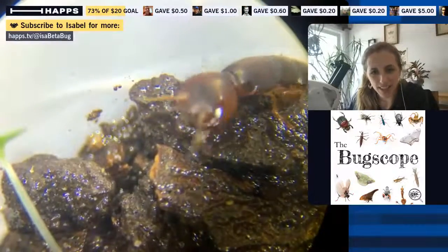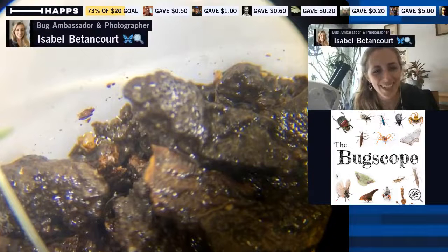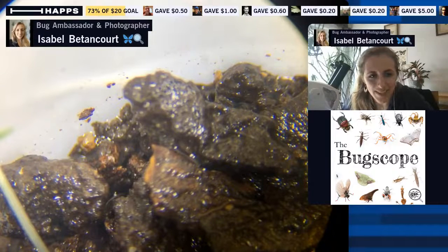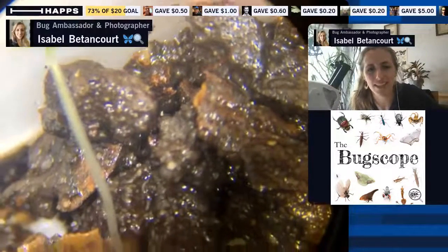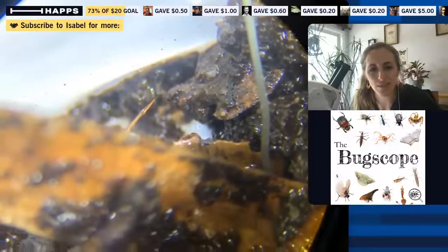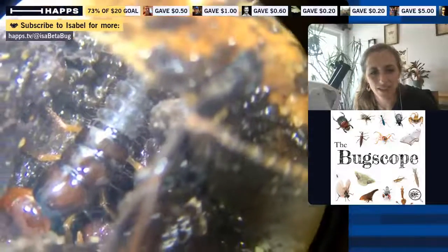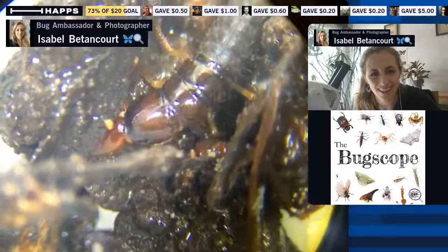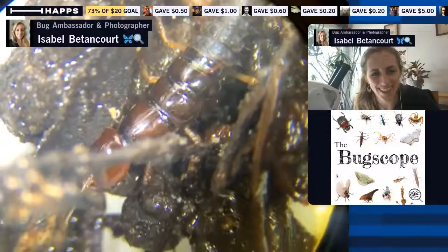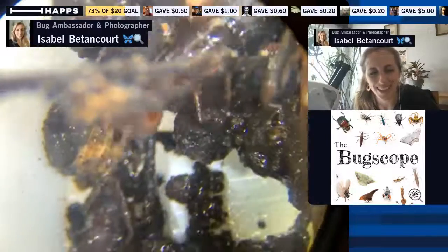I really want to get a zoom in on its head — wait, it's moving again. Darn. Well, there's our larva. David says he just bought himself a key to the beetle larvae to family or genus level — oh, here's your challenge, maybe you can help us! I know you're in the UK and I'm in the USA in Michigan, so we have different beetles, but sometimes there's overlap and similar genera too. Gotta be very stealth. It's photosensitive — trying to stay out of the light, not welcoming its 15 minutes of fame here on Haps TV.